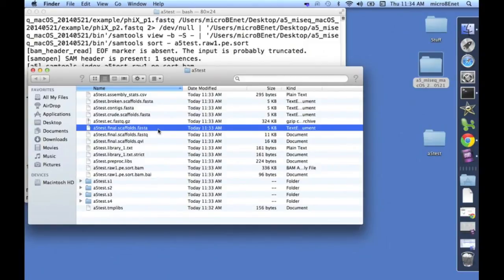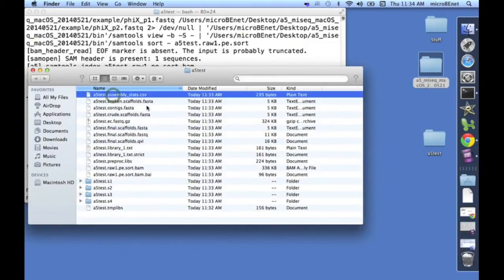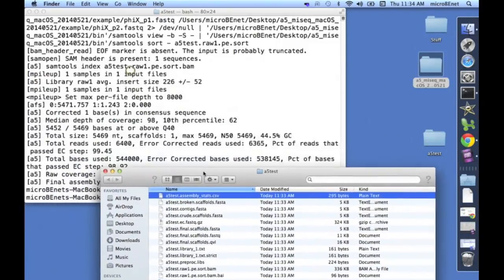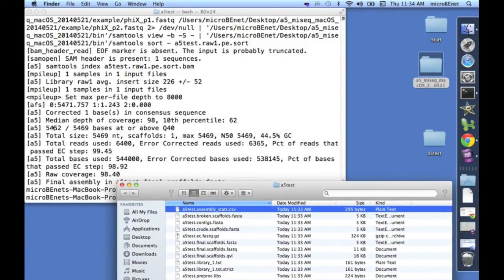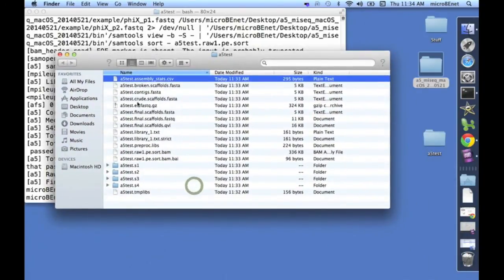In addition, A5 creates a CSV file showing all of the assembly stats, which is what we just discussed here, that you can save to look at the quality of the assembly later.